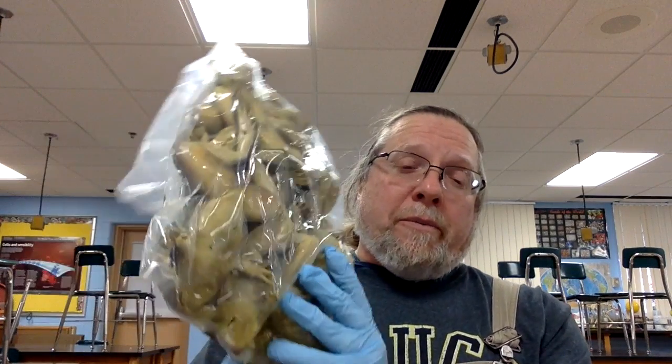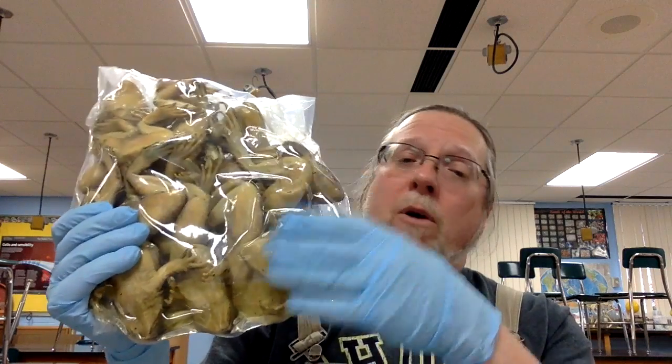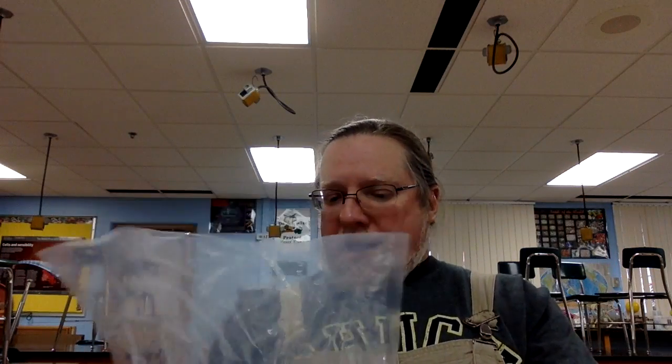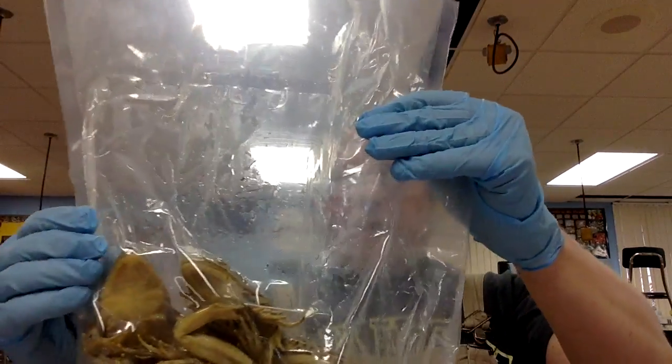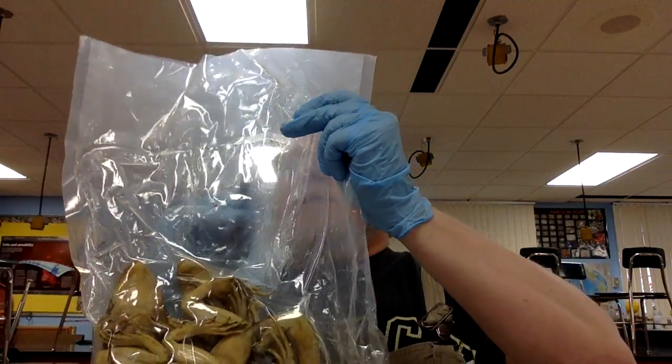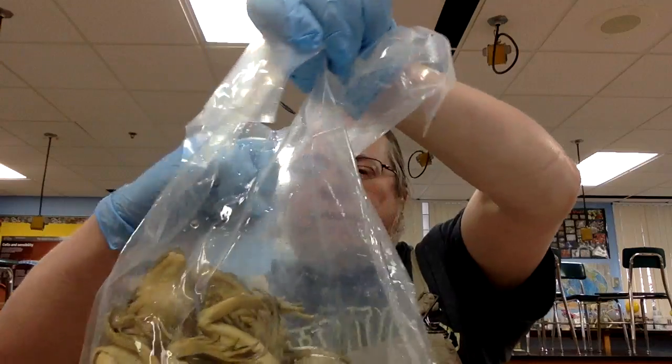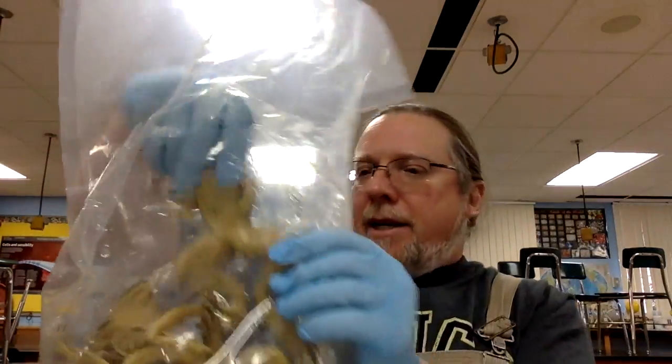Next, we're going to look at the external anatomy of some frogs. I buy my frogs from scientific supply companies — those companies raise frogs specifically for the purpose of being scientific specimens. They come to me in a bag, vacuum-packed, with most of the chemicals already removed. These are preserved grass frogs, and I will take one of them out. This will be about the size of your frogs.